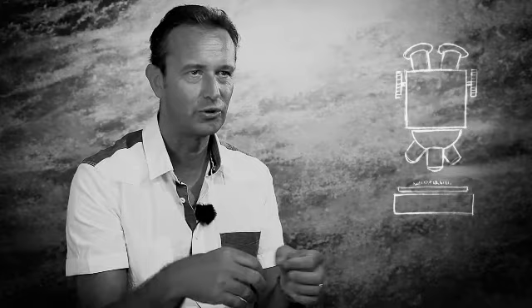These sections are cut lengthwise in the ice core so as to produce blades which will be delivered to several researchers who are then able to measure each depth without using up the entire ice core at a given depth. These blades are used in various applications.